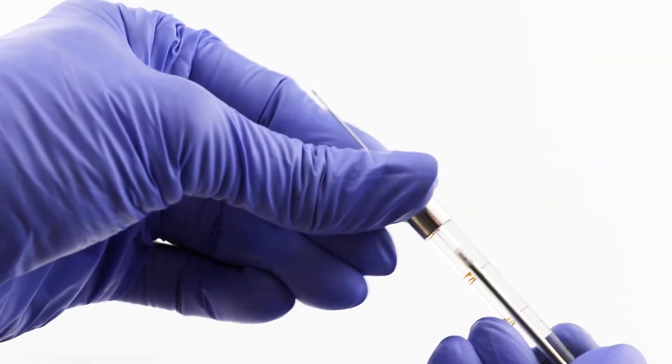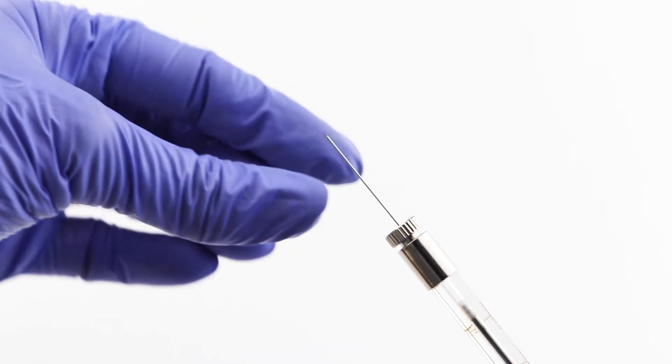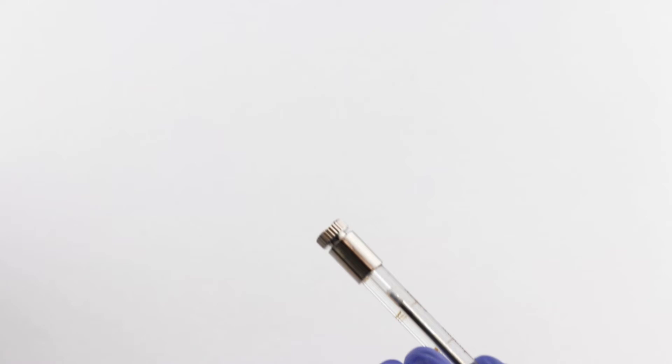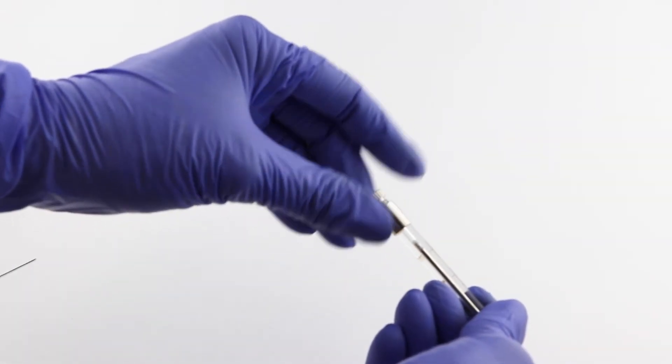To change or install a needle, loosen the screw cap by turning it counter-clockwise to release the compression on the seal. If there's a needle in place, just pull it out and it should come out easily. Then remove the screw cap and the gasket from the syringe.